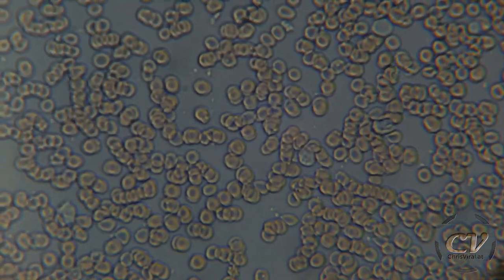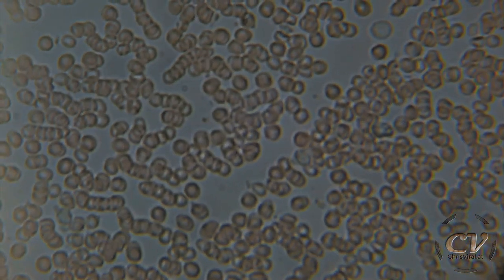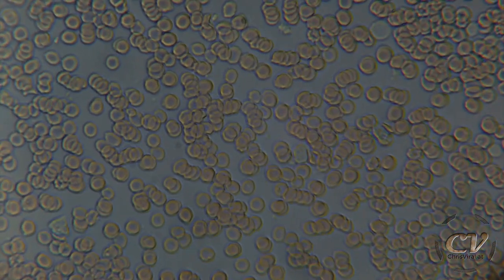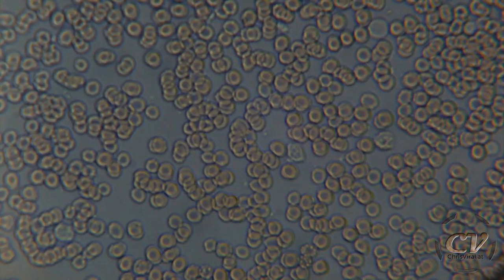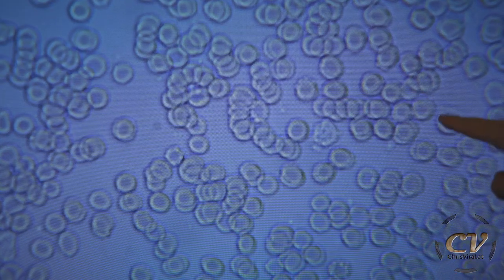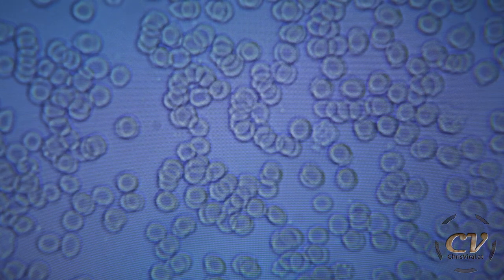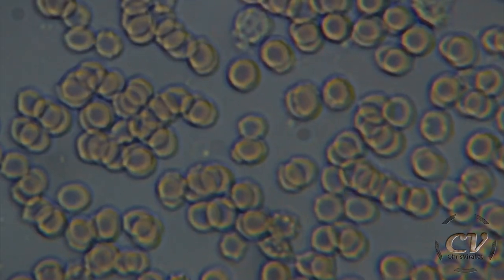Okay, that's clearly different. It's so hard to get a good focus. Oh my god. I don't know — is that a proper focus? I think that's a proper focus right there. So this is a different section. This is actually the perfect focus — I'm just pressing on the board with my finger a bit. I think that's it. What the hell is this one right here? This thing — are these like antibodies? Look at that. What are these two right here? It's looking so crazy.